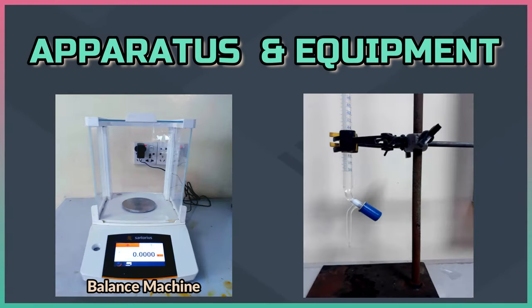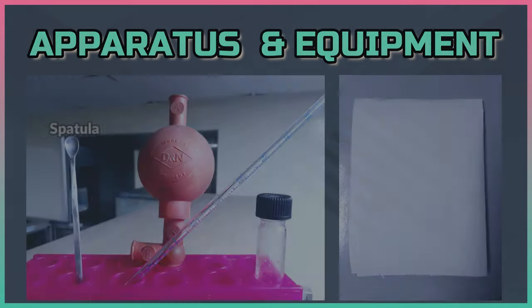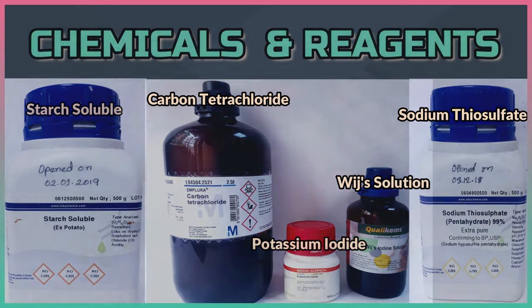To do this test, we need a balance machine, burette with stand, measuring cylinder, IV flask, spatula, filler, pipette, filter paper, funnel, beaker, and hot plate. Among the chemicals, we need starch, potassium iodide, sodium thiosulfate, carbon tetrachloride, and Wijs solution.